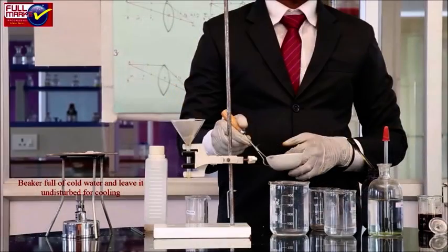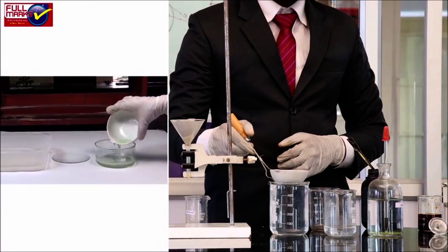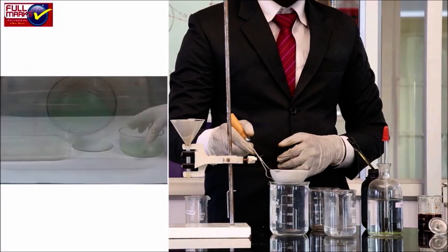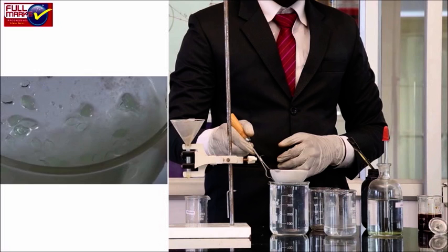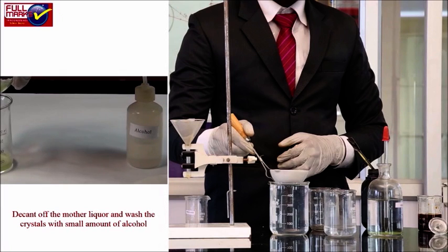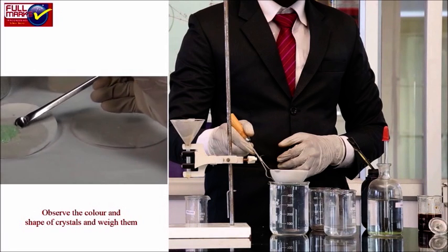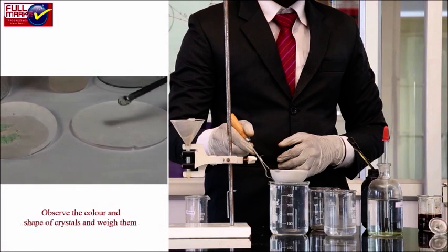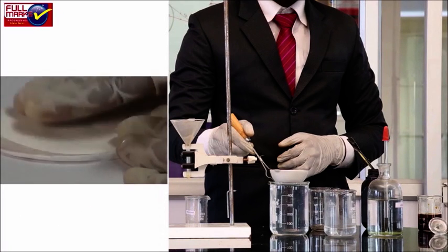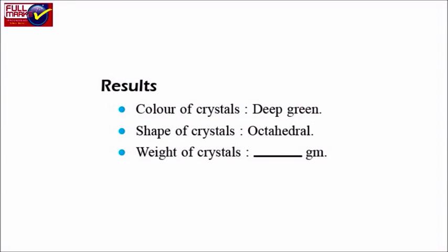Put the china dish on a beaker full of cold water and leave it undisturbed for cooling. When crystals are formed, decant the mother liquor and wash the crystals with a small amount of alcohol. Dry the crystals by pressing them gently between filter papers. Observe the colour and shape of the crystals and weigh them. Results: colour of crystals is deep green, shape of crystals is octahedral.